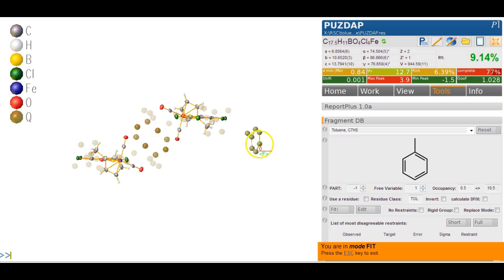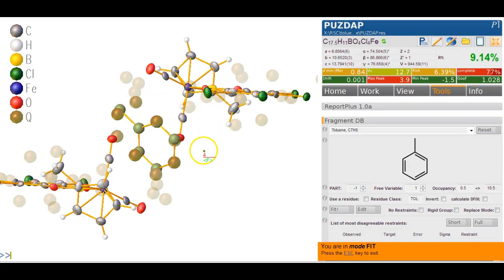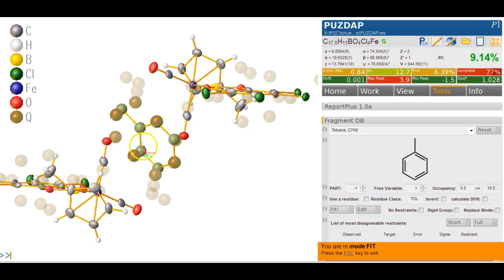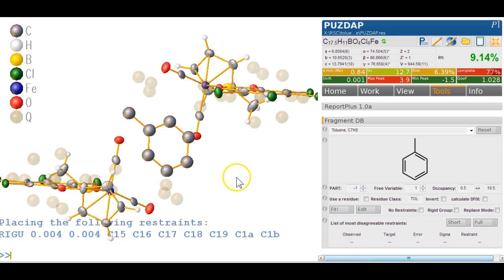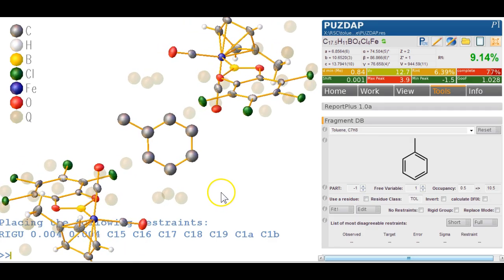So all we now need to do is match that carbon with that Q peak and then a second atom. So we click on the atom in the imported ring and on that Q peak and if you zoom in, that looks fairly good already, except we probably want that pair as well. Once we're done, we hit the escape key at the bottom here and we fitted this whole toluene into this structure.